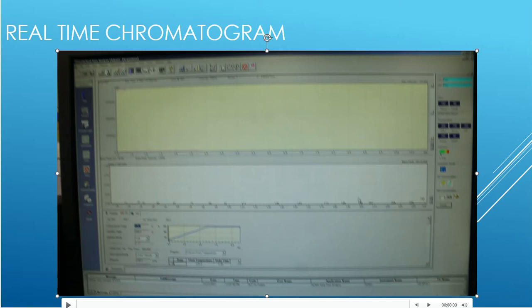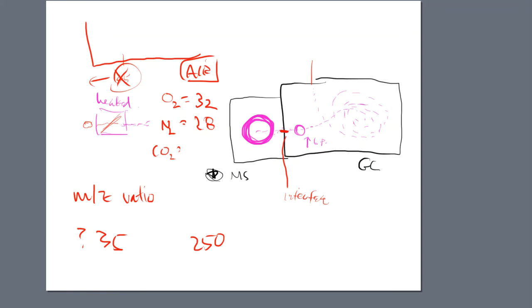We actually use it for a number of things, folks. The mass spec is heavily used in our laboratory. We can actually use it for any type of pharmaceutical use. So if we're producing some type of tablet or medication and we want to look at maybe that particular active ingredient, or maybe the contaminants that could be coming along with the tablet or that liquid solution or whatever we're making, we can analyze that on a mass spec, and it would kind of tell us what is present and what is not.